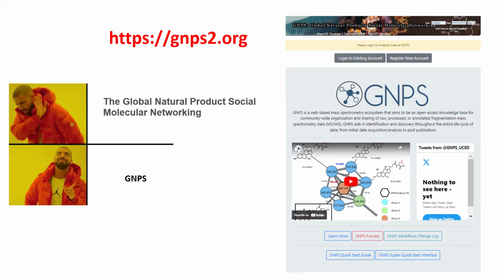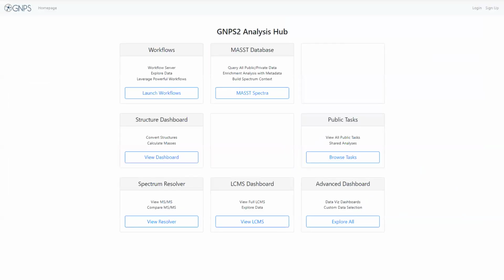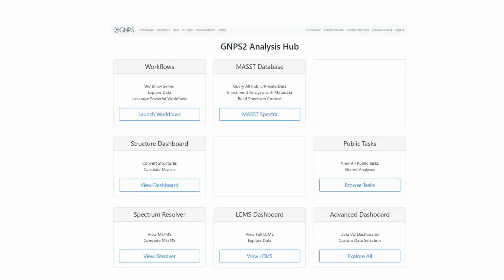So I think all of you got the token from Carlos. Is there someone who couldn't log in or had some problem doing it? Okay, great. So please log in to your GNPS2 account. Are you in? Great. Okay. Did you set up everything? Does someone have a problem doing that? No? Okay. Don't be shy. Just interrupt me if you have any issues.